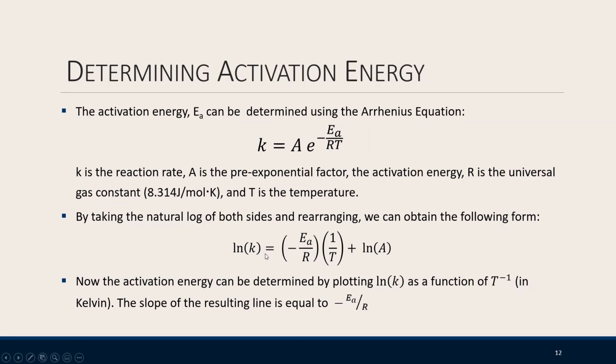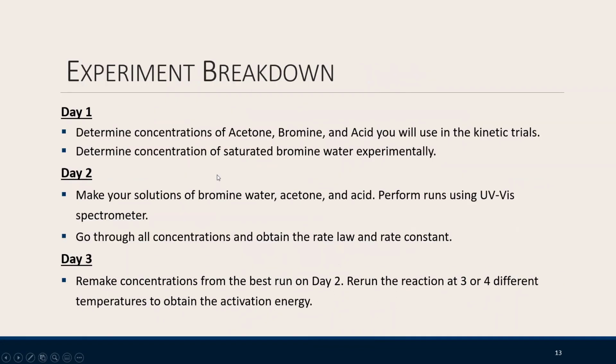here. So that'll be just the same as your question 4. You calculate the K value at a different temperature, and then you make a plot using log K versus 1/T. And then this part, the slope part, you need to find out the EA value. And then you can use Excel to generate the uncertainty of EA. So it will be just exactly the same as your homework 1, question 4. So this is a 3-day experiment.